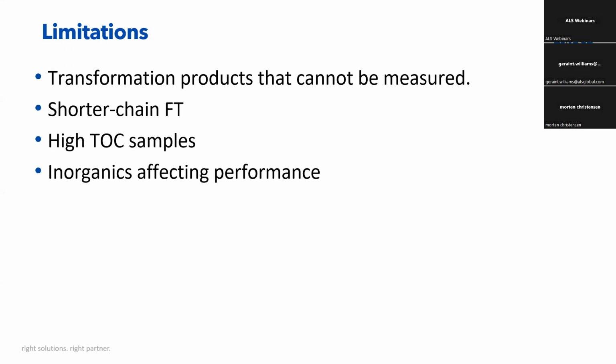I know with certain acid matrices, for instance, where we've got low pH, we do have difficulties reaching a pH of 13, which is one of the requirements of TOP assay. So there's careful management required to make sure that when we're using sodium hydroxide, it reaches the appropriate level of pH. Otherwise, there's no point carrying out the TOP assay in the beginning.